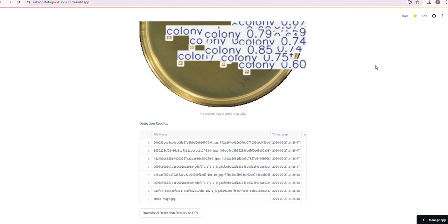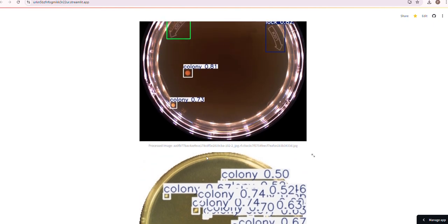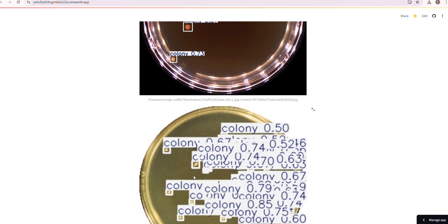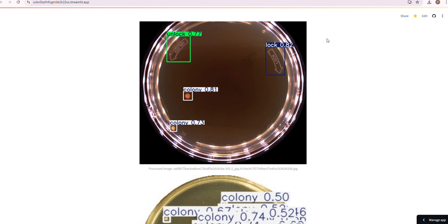But the real power behind computer vision is the fact that this plate and this plate are both agar plates, and that these are bacterial colonies. Whereas you may have to have a lot more control with imaging techniques in terms of the lighting and the position of it and the distance from the camera, there's a little bit more flexibility in computer vision because in many ways it sees similar to the way human beings see, and then it classifies information and reports that information back to you.